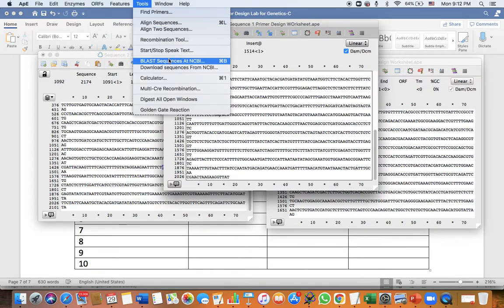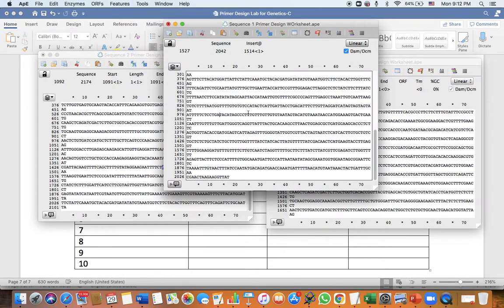Now you could do other things, like look for NCBI BLAST sequences that match these sequences here. Or you could simply copy this sequence and paste it in NCBI BLAST and find out what these actual sequences are. Another thing I could ask you to do later on is to take these sequences, not only identify what the full genomic DNA is or what organism they come from, because I already told you that, but I could also ask you, where does the insertion come from? What gene is actually the gene that is inserted, the key gene that I inserted in there, and which part of the gene that I deleted, from which organism, and which gene it actually is.